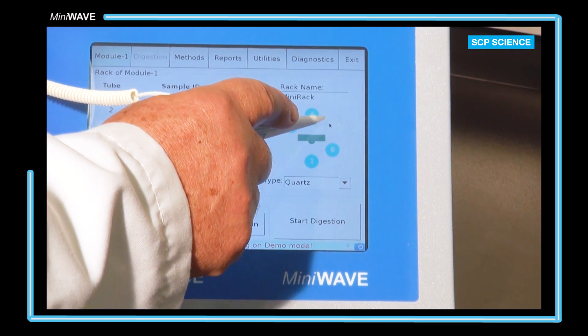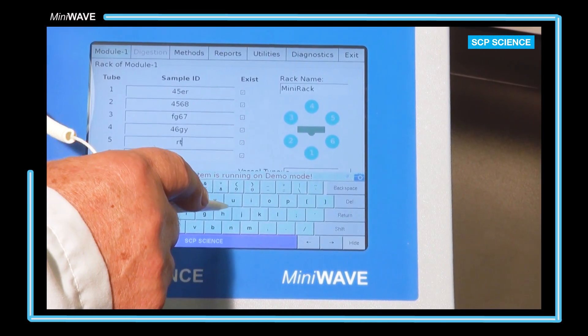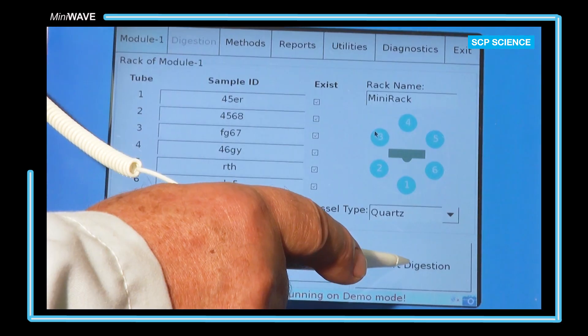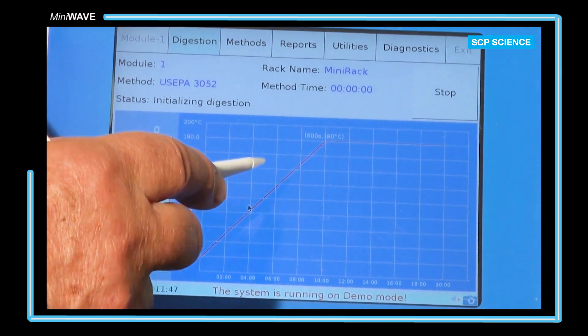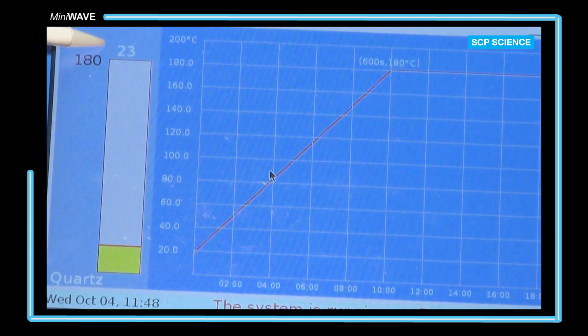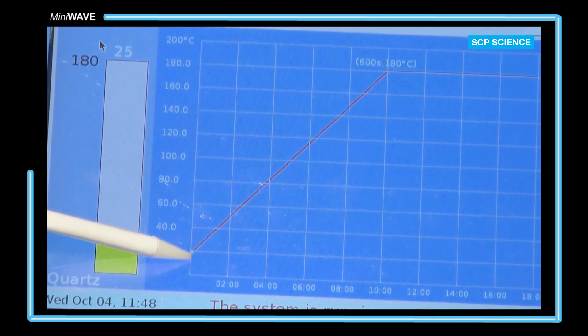If the user has less than a full rack to run, samples may be run in a symmetrical order. Under sample ID, the user can enter an alphanumeric value which will be carried through to the reports page. On the digestion tab, the average starting temperature of the samples will be displayed in white, with the set point temperature in black. The graph is updated in real time.